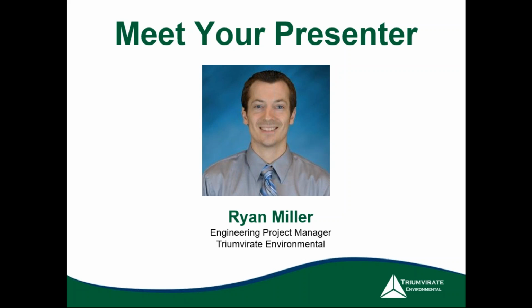Hey, welcome everybody. Just a little bit more about my background as it pertains to sodium azide. I was a lab pack chemist when I started here at Triumvirate about 8 years ago. So I have experience with performing lab packs with sodium azide, virgin sodium azide, also sodium azide in solution. After that, I started moving into the engineering role, and we've done wipe sampling for sodium azide after a lab is decontaminated. We'll go through, decontaminate the lab, and do wipe samples to ensure that sodium azide has been removed. That's a laboratory analysis that can be performed.